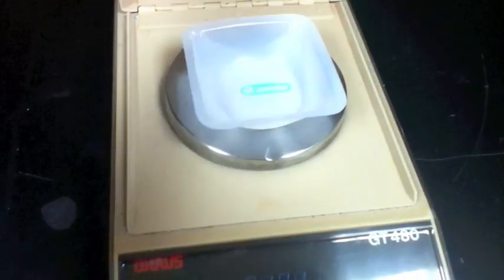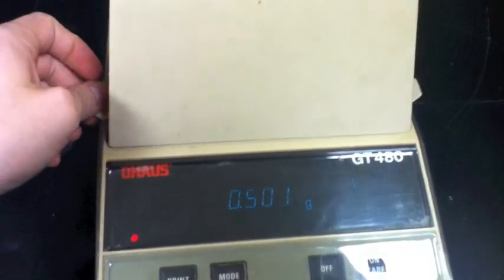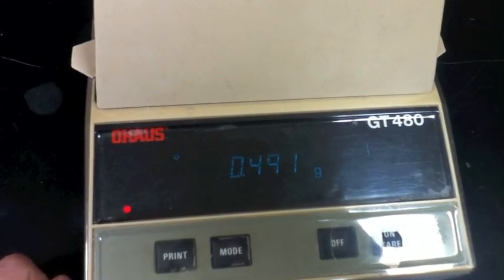Once the mass is shown as zero, I'm now ready to place the paperclip inside of the weigh boat and obtain its mass. Remember to close the lid for accuracy, and the readout I obtain is the mass of the paperclip.